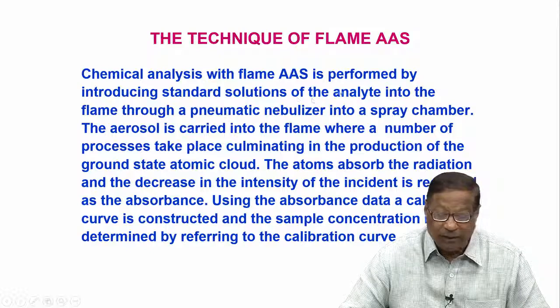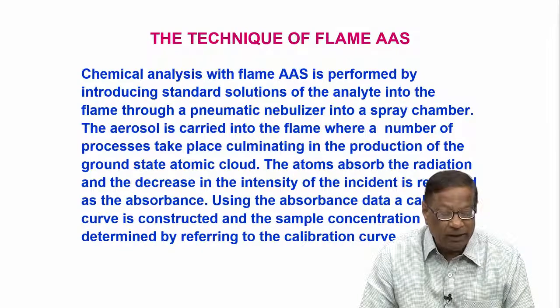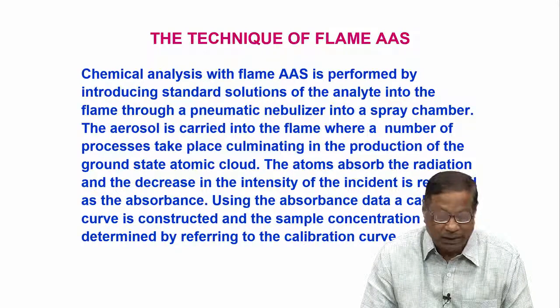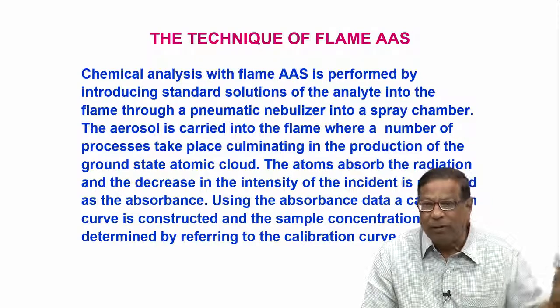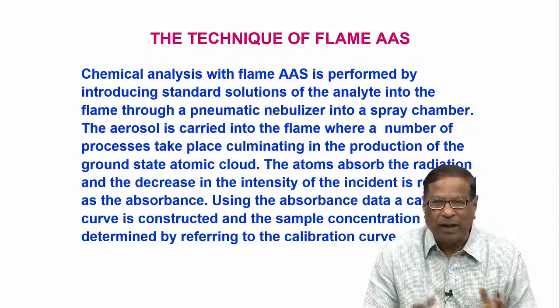Chemical analysis with flame atomic absorption is performed by introducing standard solutions of the analyte into the flame through the nebulizer into the spray chamber. The aerosol is carried into the flame where a number of processes take place, which we have already discussed, but will discuss once again, culminating in the production of the ground state atomic cloud. These atoms absorb the radiation coming from the hollow cathode lamp.